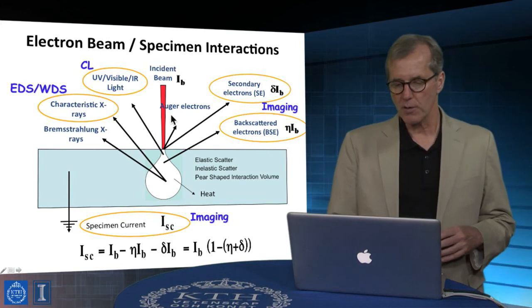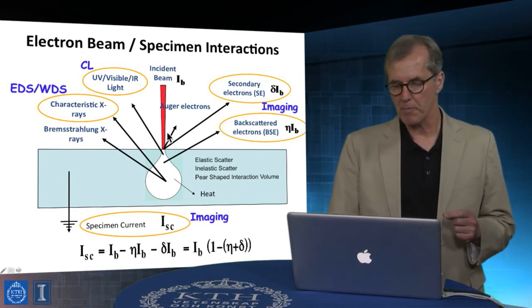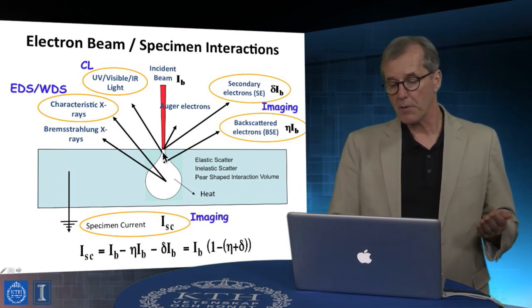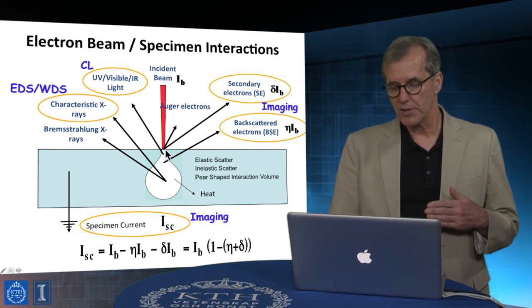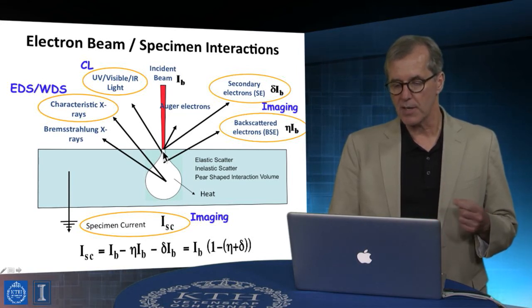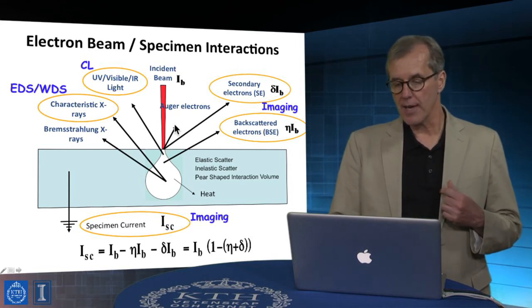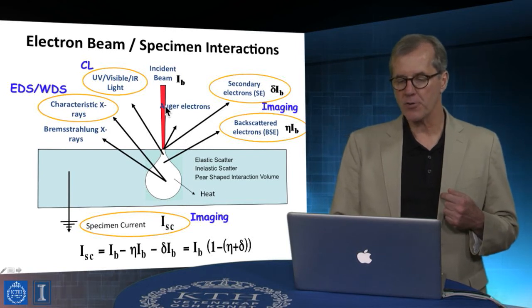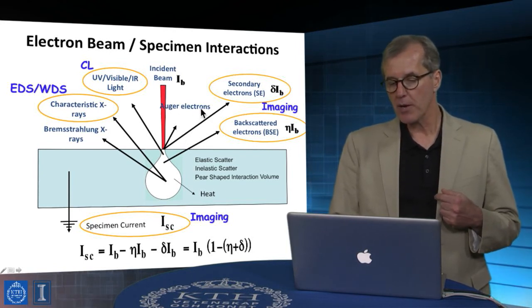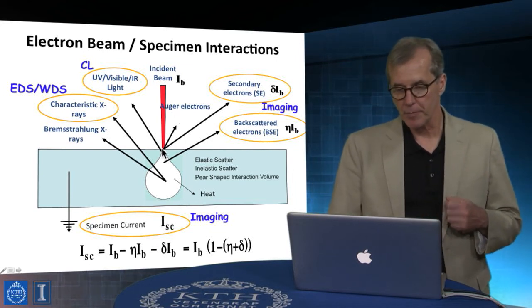I can put in an electron beam, a narrow diameter, low divergence electron beam, and we saw one of the outcomes is that within a very shallow region of the sample surface, in the vicinity of the primary excitation, we can energy analyze electrons and extract the rare fraction of electrons coming out of the sample that correspond to Auger electrons, and that's surface sensitive information.